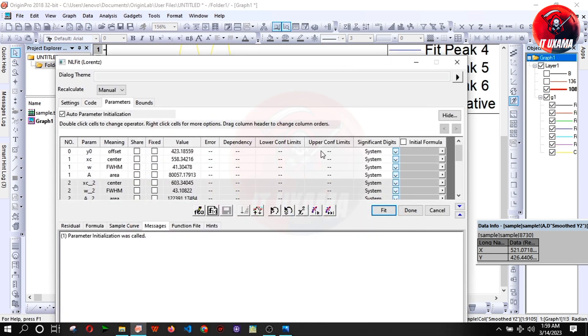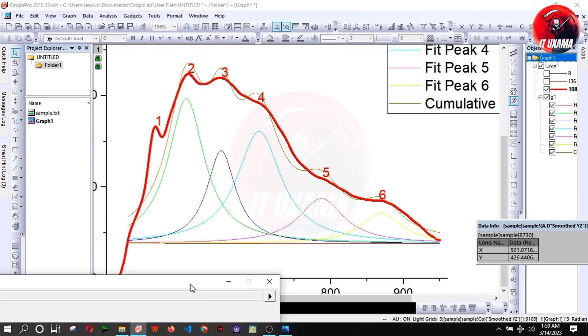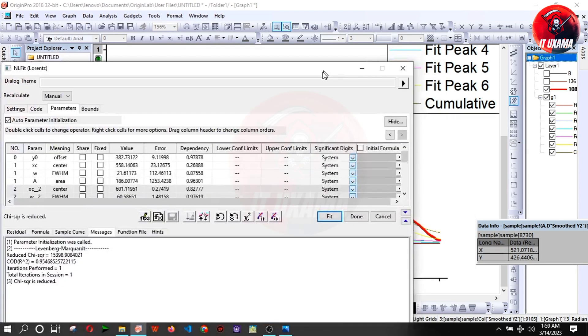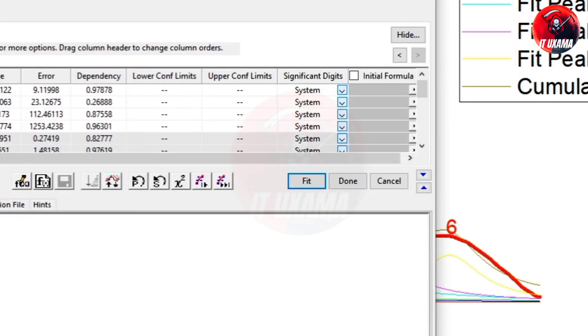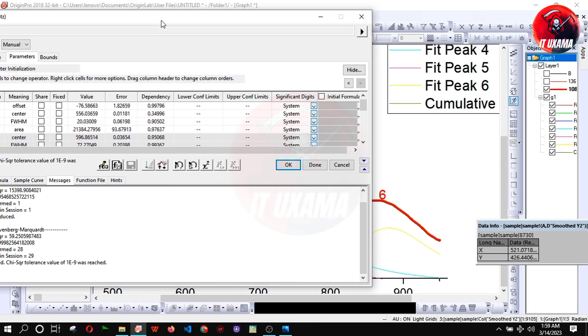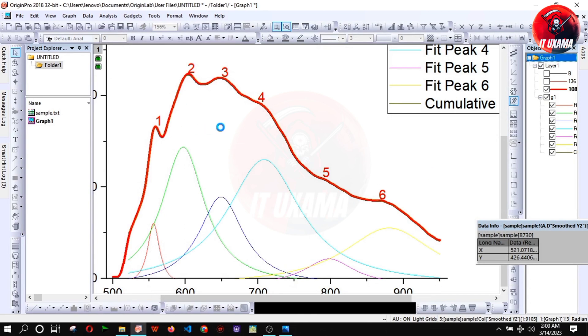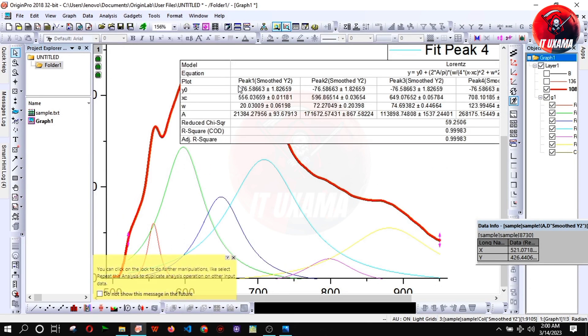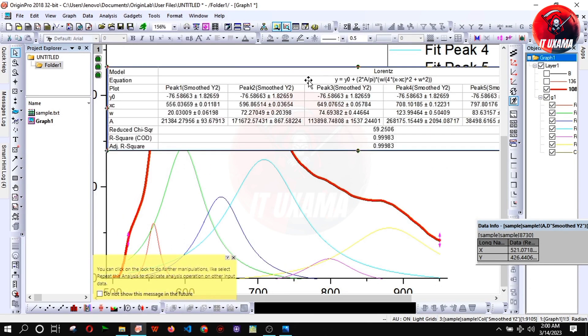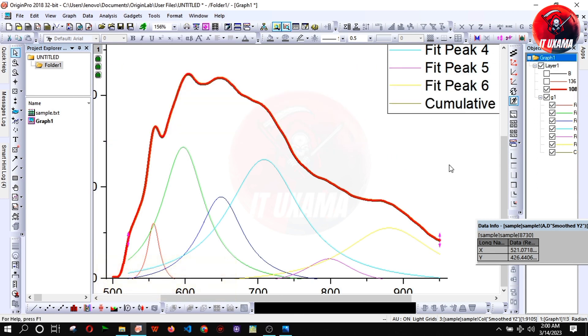Now we have to run the iterations until converge. We will also get the table including all information of fitting with equation. You can see the deconvoluted curve is perfectly on the real curve.